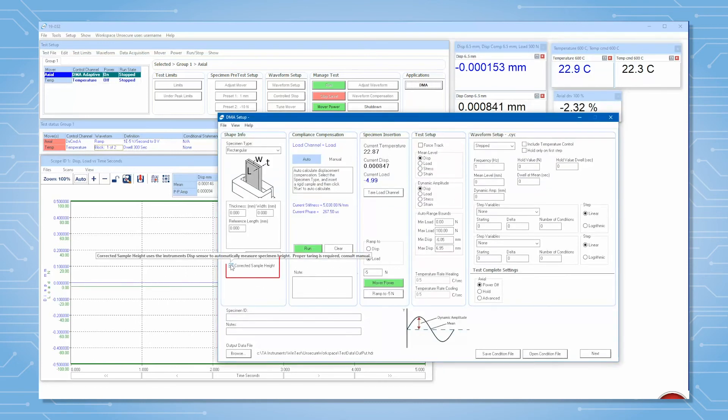In the DMA application, check the corrected sample height option and type in the height of the standard block. After completing this step, you should not unlock column clamps or use micro adjust anymore. The software will now automatically calculate your sample's length.